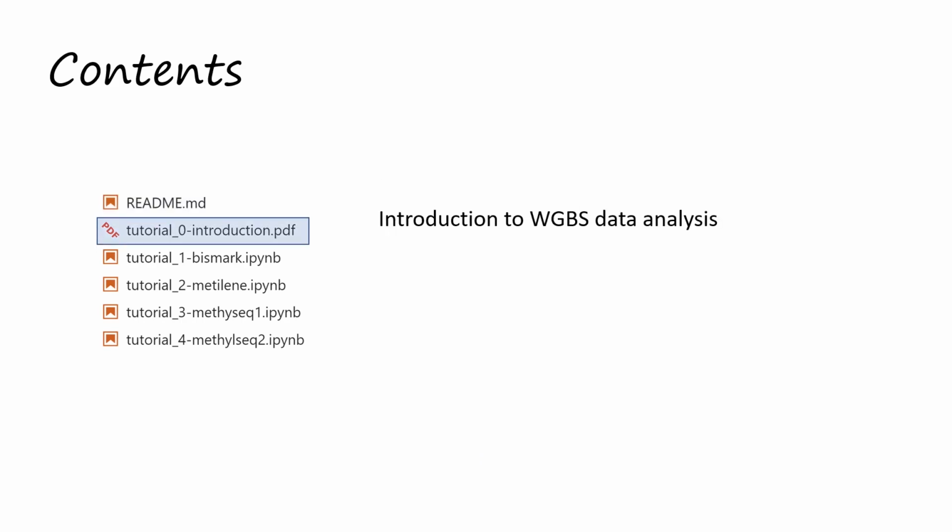The next file is the Introduction PDF file. It offers the basic scientific background of DNA methylation, WGBS, and the steps to analyze WGBS data. This is more theoretical compared to the real data analysis modules following.